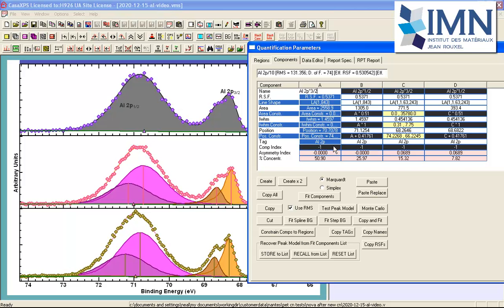If I enter in the first column, though it doesn't necessarily have to be the first column, the word step, then what this does is it enters 0 for the first column, 1, 2, 3. So we've incremented the component index along these columns within the component's property page. And what this means is that the component colors, as indicated by these component indices, will be the same as the default colors that would be used to plot components.